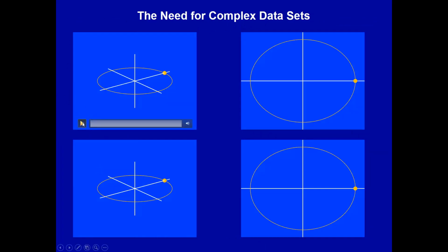Okay, so here we go. Now if we were able to change our perspective and look straight down on the XY plane, we would be able to tell that the magnetization was rotating clockwise. Or this other, let's go counterclockwise, where there's a slightly lower frequency, so a negative frequency in our spectrum, lower than our carrier frequency, we could look straight down on it and see it moving counterclockwise. And our ability to make this clockwise or counterclockwise distinction is from something called quadrature detection. That'll be explained later in Dr. DeGraff's hardware lecture.